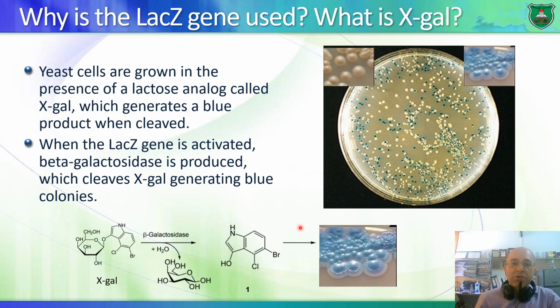Okay? So again, if you have a yeast cell, and these yeast cells, just like bacteria, grow into colonies. Each colony is a clone of a single cell. So if you have these yeast cells within a colony producing X, of course, the known protein, and Y, whatever Y is, if X and Y interact with each other, you have stimulation of transcription producing beta-galactosidase.